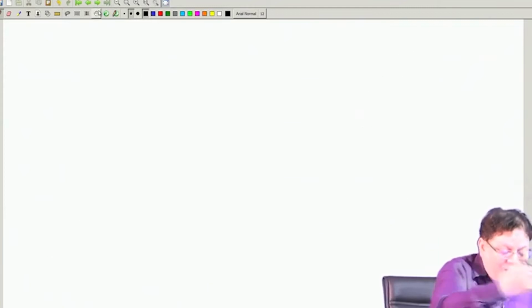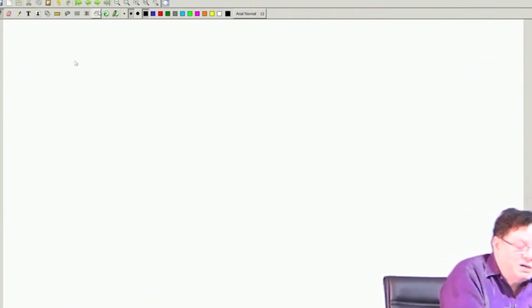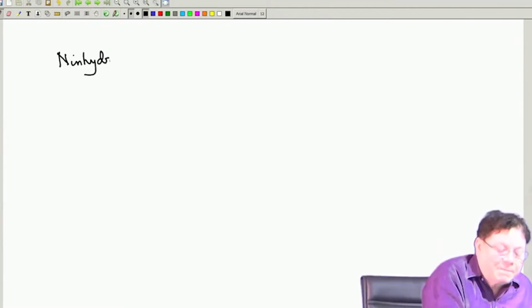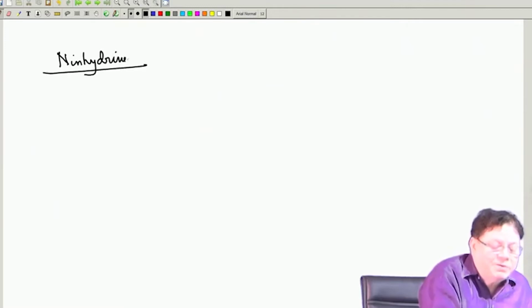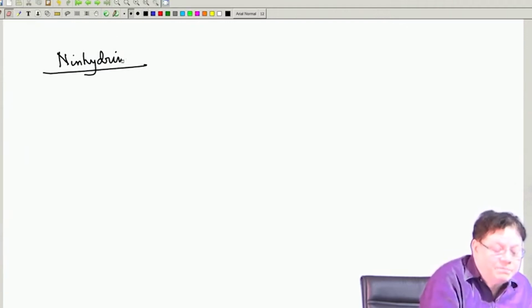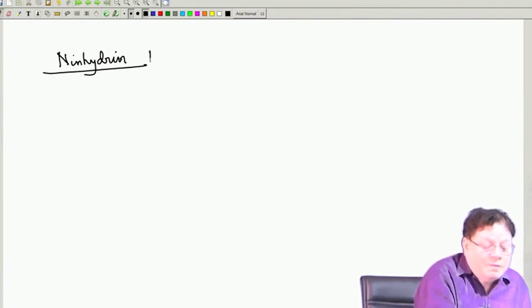So, what is that reaction? It is well known, you might be knowing it already, the Ninhydrin test. Okay. Ninhydrin, sorry. Ninhydrin test. This Ninhydrin test is what?